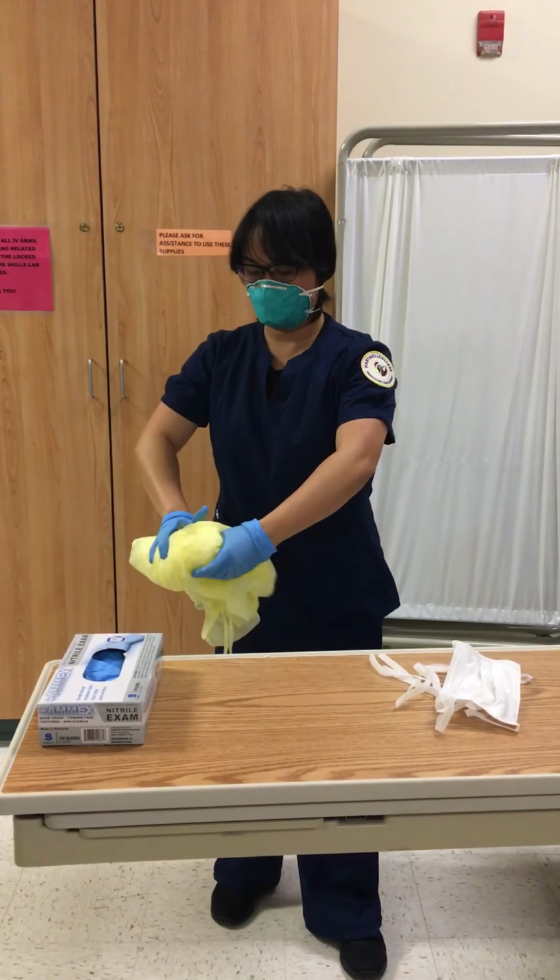And then the next one would be the hair covering and the protective eyewear, and then the gloves. So remove the gloves. Then you dispose of them in the biohazard bin. And then you keep your mask until you're in the ante-room.